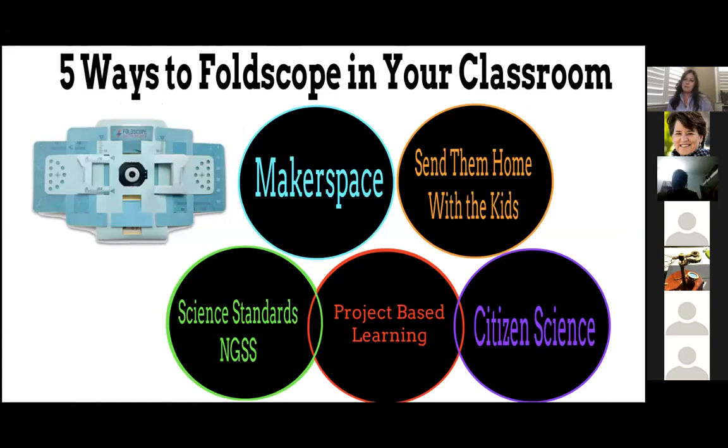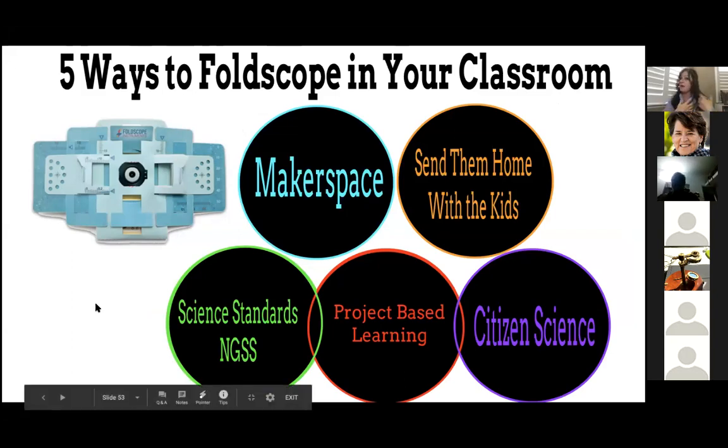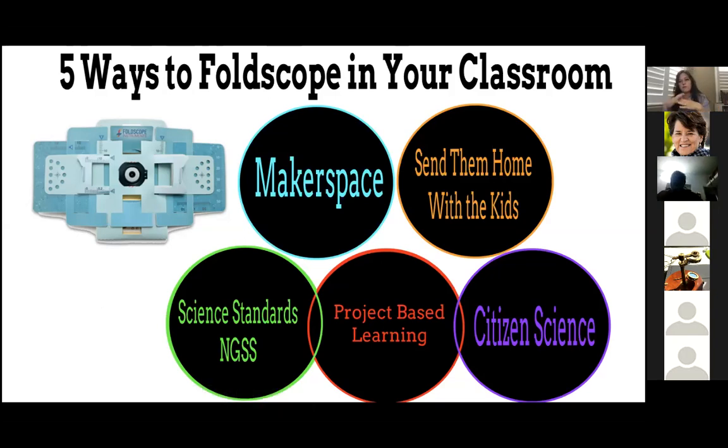So that kind of wraps up my five ways to Foldscope in your classroom, starting with the makerspace, sending them home with kids and having them bring back or share with you digitally, depending on whether you're going to be in face-to-face or distance learning. And then merging those ideas with the science standards, project-based learning, and citizen science, all launched from Foldscoping.